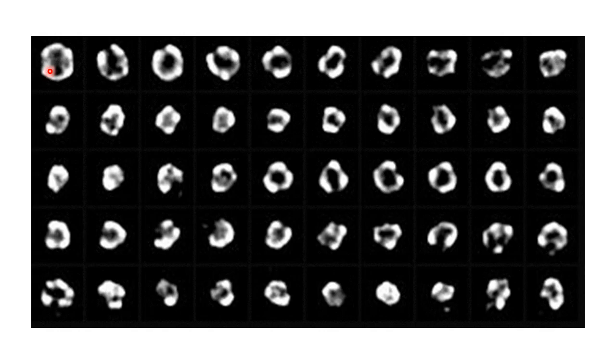The images were collected from that raw data, and then all those selected boxes were used to produce the image of the specimen in one orientation. This is corresponding to the set of images which were obtained for another orientation of the specimen. The next one is a third orientation, the fourth orientation, and so on.